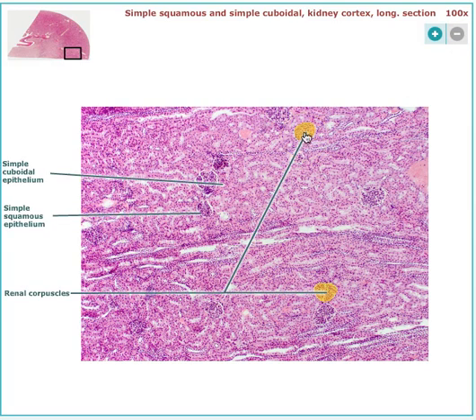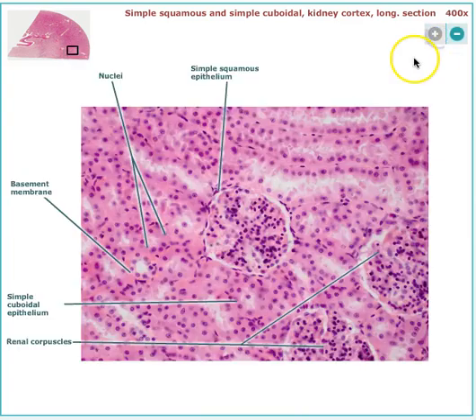here, these are the renal corpuscles, and we'll get to that when I cover the urinary system. But I want to show you guys, if you see here, where the shape looks a lot rounder, and you can see this lumen highlighted in yellow, this is going to be the cuboidal epithelium. Because remember, we talked about how cuboidal epithelium surrounds ducts, D-U-C-T. So because of that, you tend to have this lumen, this opening.